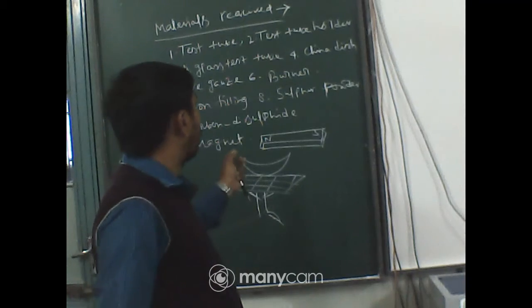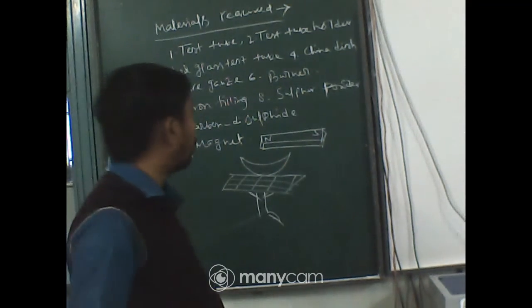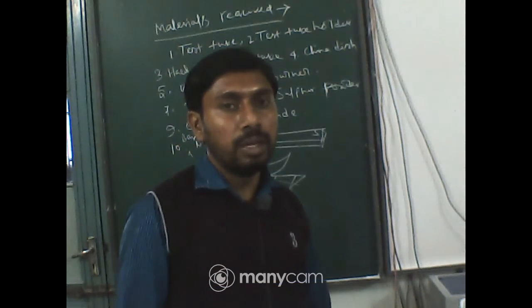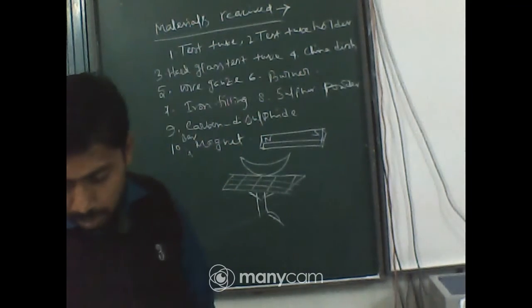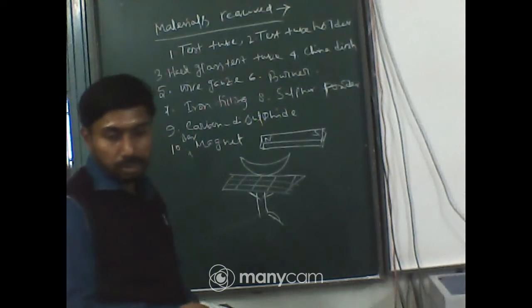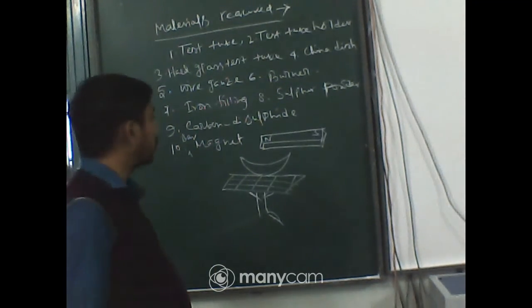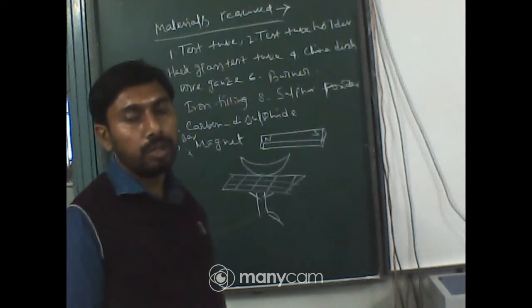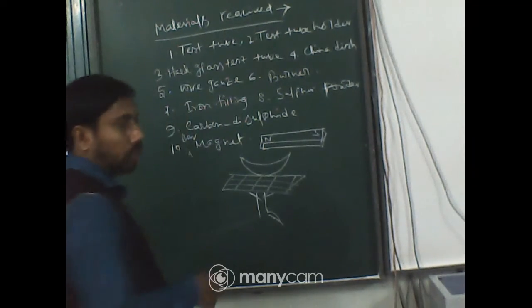Now, we will mix it up and then add the solvent, and whether any part of it is dissolved or not will be seen in your observation portion. Next is the procedure. Completed the materials required? You can only write magnet, but as magnets are of different forms, bar magnet will be the appropriate one. Completed up to this?